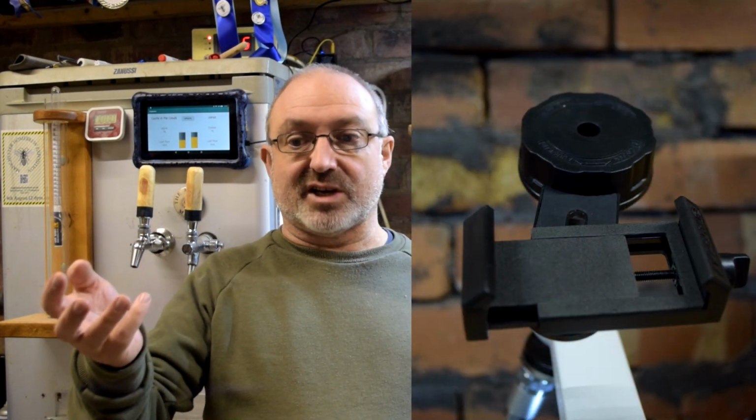I bought a microscope second hand off a bloke somewhere a few years back. It must be maybe a year ago. He'd been using it to test his pet fish for diseases, which apparently is something you need to do. I got the hemocytometer online and have been having a little bit of a play with it, but haven't really had a good go. For this video, I was really wondering how I was going to get you any pictures of the cells, but I found a cheap thing that attaches my phone onto the microscope, which was quite useful, and I managed to get some quite nice pictures, so hopefully this will be interesting.